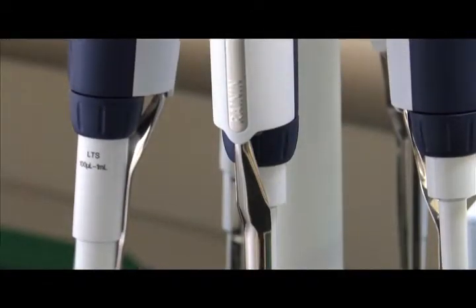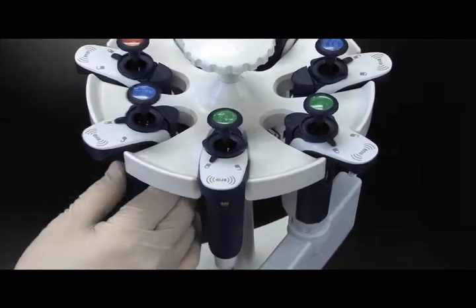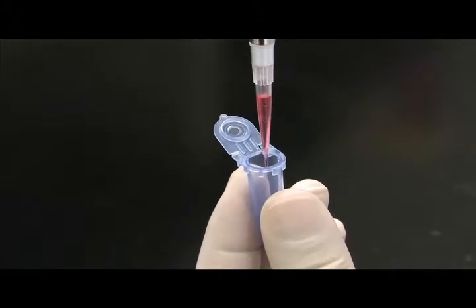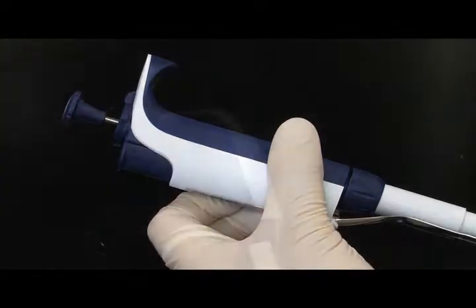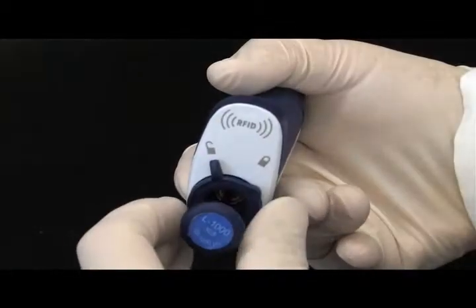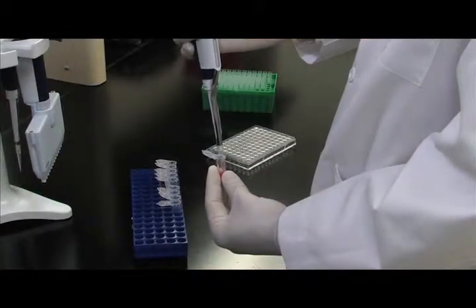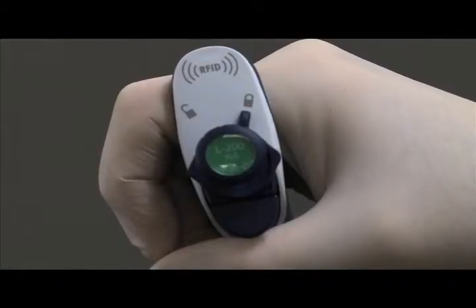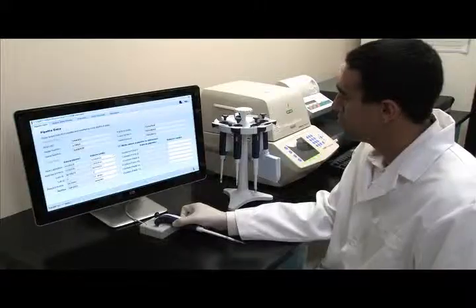With its new Pipette Lite XLS family of precision pipettes, Raynin again raises the bar on pipetting innovation and superior reproducible performance. Its reshaped body, contoured finger hook and lighter springs give hours of ergonomic comfort. The enhanced lock mechanism engages easily and assures accurate volume delivery from first aliquot to the last. An embedded RFID tag enables advanced calibration and workflow management.